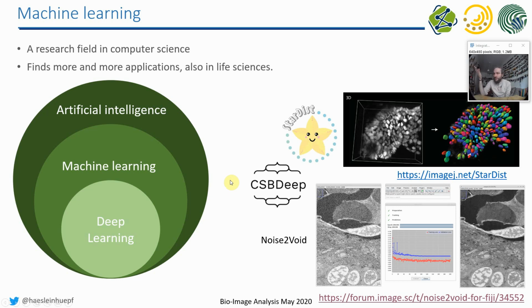Then you have more sophisticated plugins, for example, for segmentation, like StarDist. Also, this comes as an ImageJ plugin, and there is a platform called DeepImageJ, which actually aims to deliver various kinds of deep learning models to ImageJ and Fiji users. So maybe also check this one out. I'm just mentioning a handful here, and I think the number of algorithms is exploding these days.